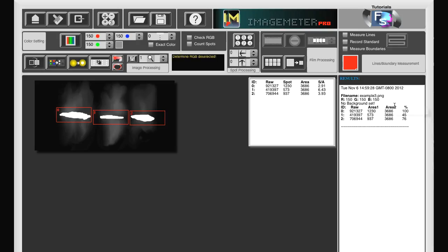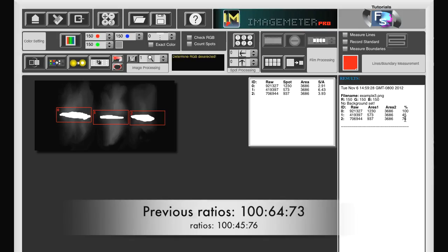And now we get the ratios. These ratios seem to be more reasonable than before. The number 3 band has a larger density than the number 2. And of course, number 1 has the largest density, since it is the reference band with 100%.